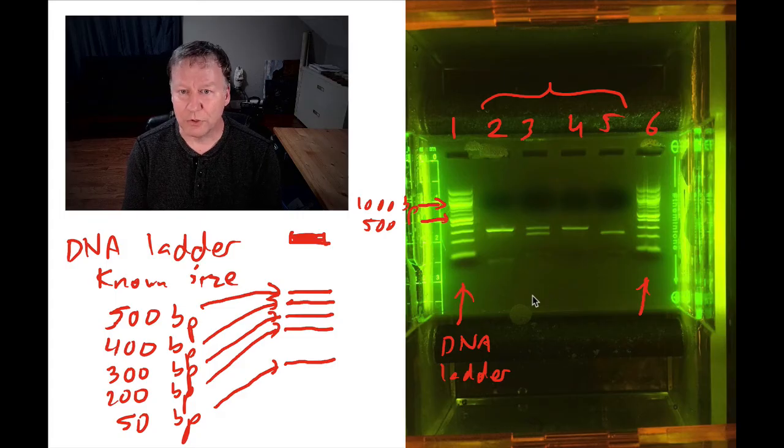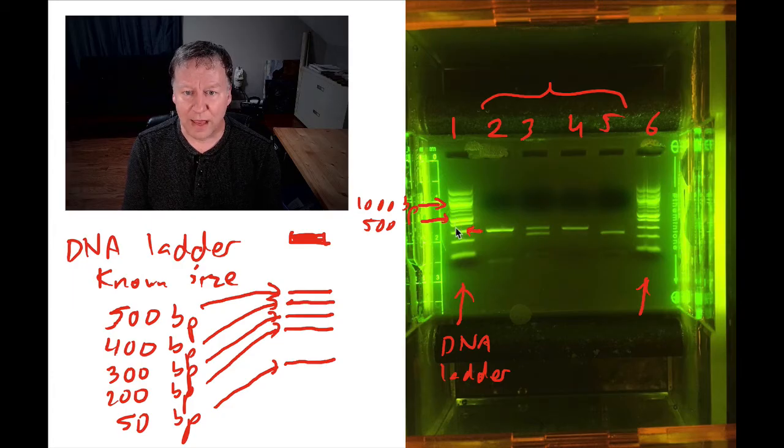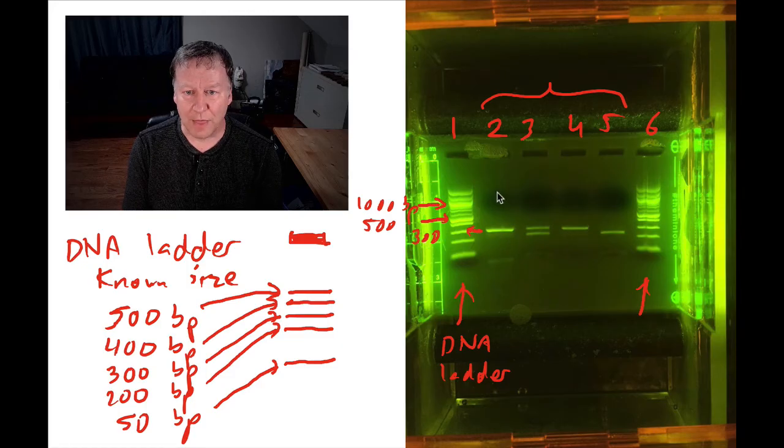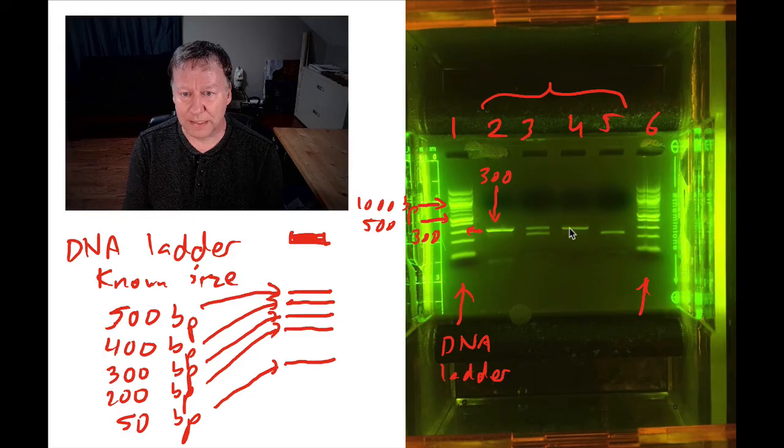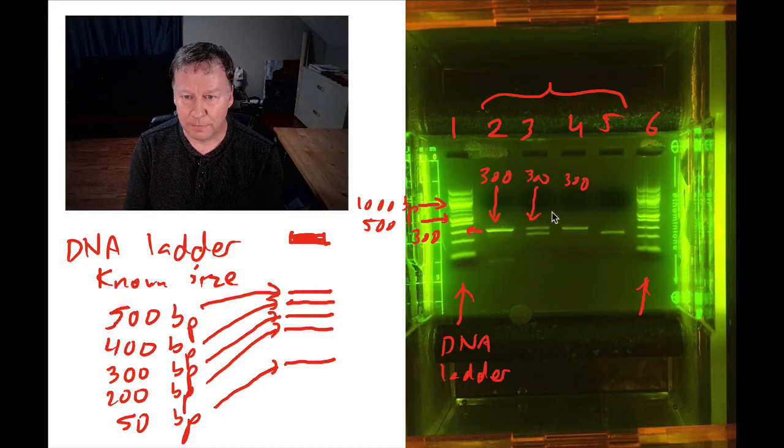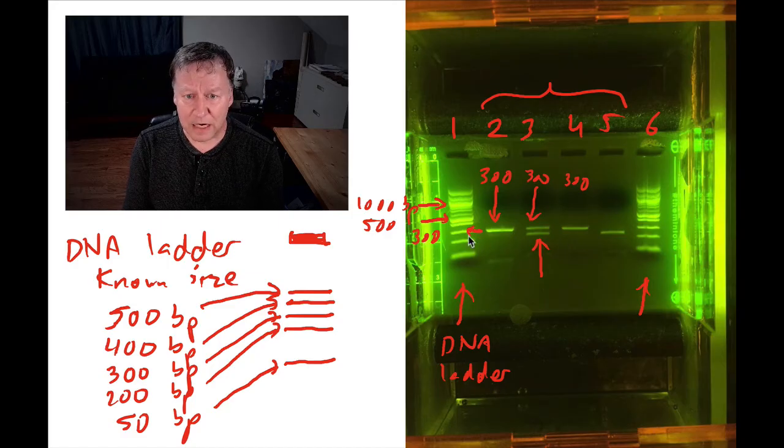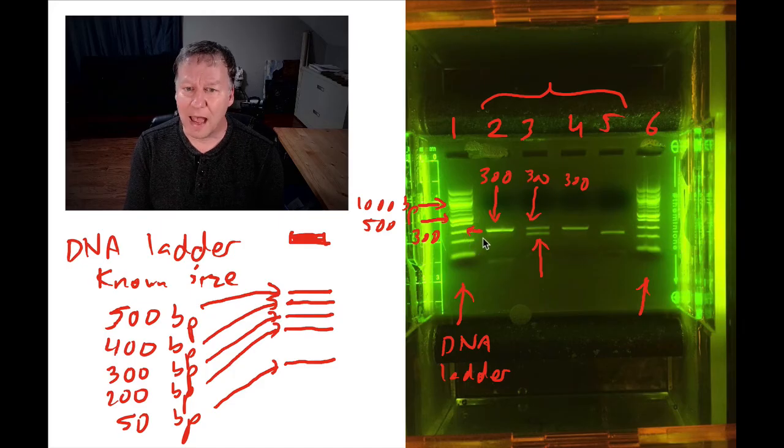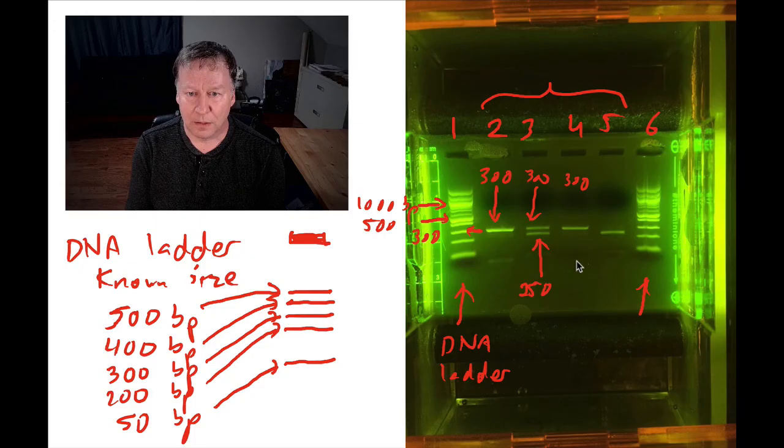So now that I have my ladder, I can go over to my unknown values in lanes two through five and start doing some comparisons. When I look at lane two, I see that it is the same size as this band right here in the ladder. I know that one is 300 base pairs. So that means that piece is also 300 base pairs in size. Lane four was the exact same size. So that one is also 300. The top piece in lane three is also 300. So I'm starting to get exact sizes. If I look at this bottom-most one in lane three, I start to realize this is kind of between my 300 and 200. It looks about halfway in between to me. So I think that one is probably about 250 base pairs. And lane five also looks like about 250 to me.